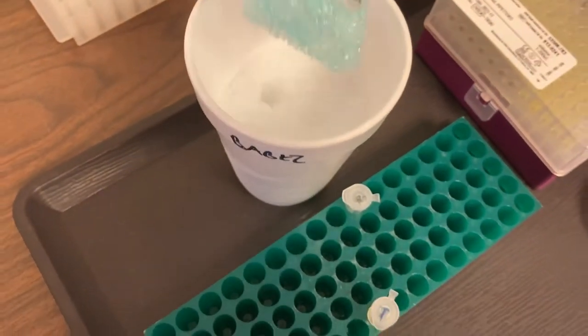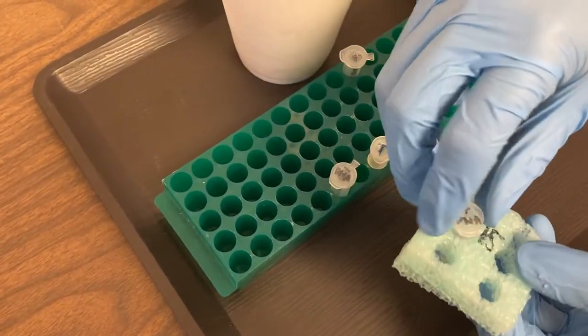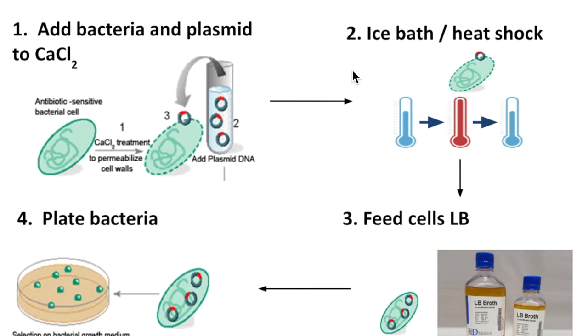After your two minutes is up you want to take those tubes back off the ice and put them into your microtube rack. All right we made it through part two of the lab. Before we head on to part three let's do a quick review of what this bacteria has gone through. We mentioned that we added it to calcium chloride but we didn't talk too much about what calcium chloride does. It permeabilizes the outside of the cell membrane and cell walls of the bacteria. That means it's making little holes or creating small pores. Why would we want to do that? Then we put those bacteria into an ice bath and then we did our 42 degree heat shock. So that bacteria has been through quite a bit.